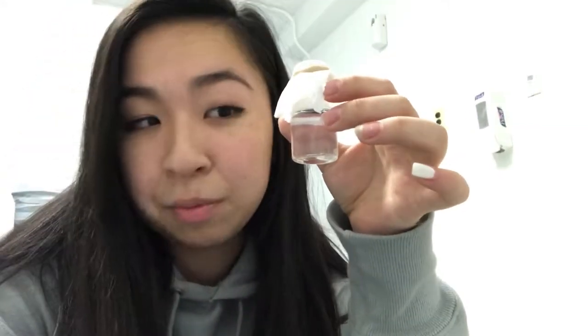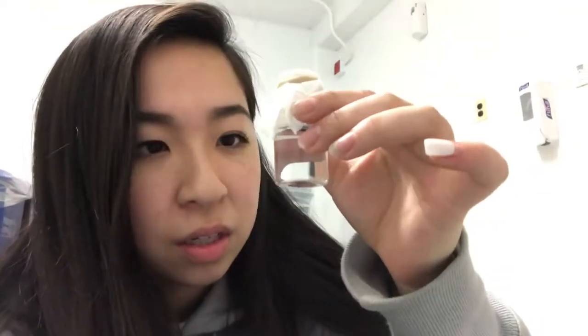They look like teeny tiny grains of, I wouldn't say normal table salt, but the thicker salt that you can sprinkle on meats. There's not that many. It hasn't grown too much. They look like little pebbles of sand. As for week 1, there's not much growing yet in the vials.